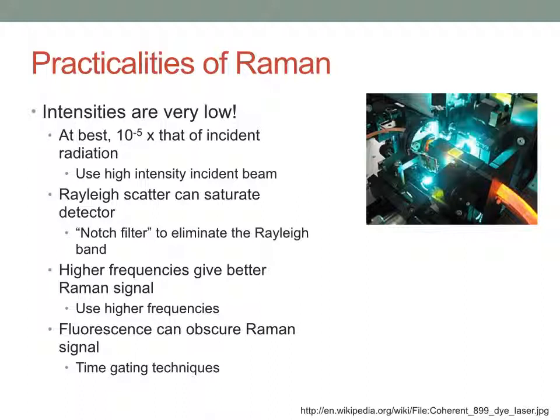The other big problem with Raman is that I said the spectrometers are very, very similar. I start to excite a sample. If I'm hitting it in its absorption band, I can see fluorescence. No, not I can see fluorescence, I will see fluorescence. And this can be a real problem for Raman spectrometers.